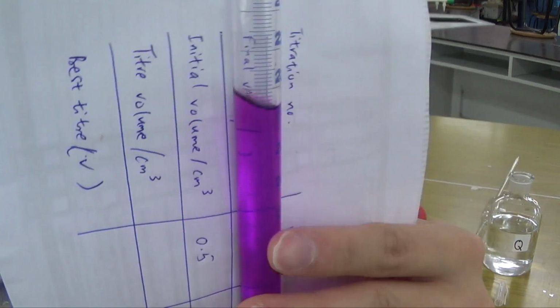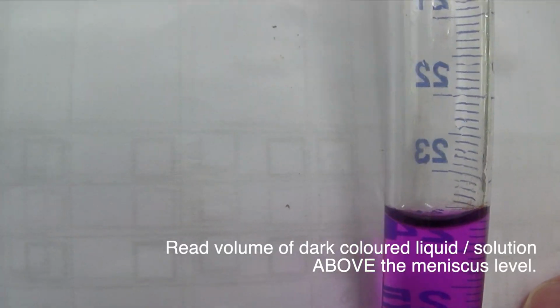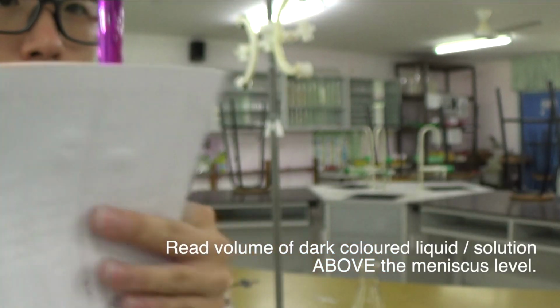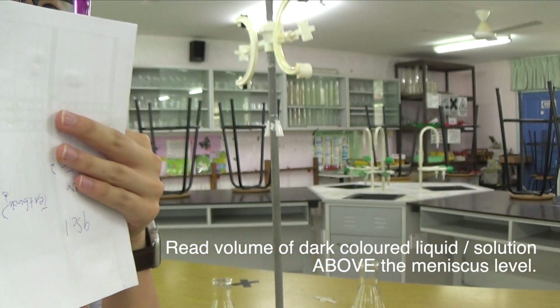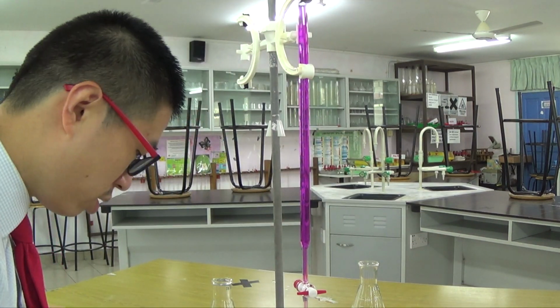So for my rough titre, let's see if I lift this up a little bit, and hopefully you can see it against the white background. 23.3. Not too sure if that is clear. You read above the meniscus, so 23. Is that reading very well? Probably not. But you can see that 23 is on top, 24 is at the bottom, so you read from top to bottom. There's around 23.3 if I read above the meniscus.